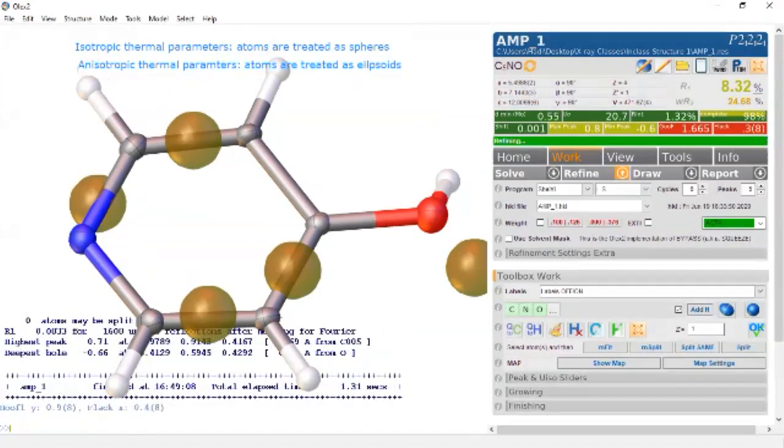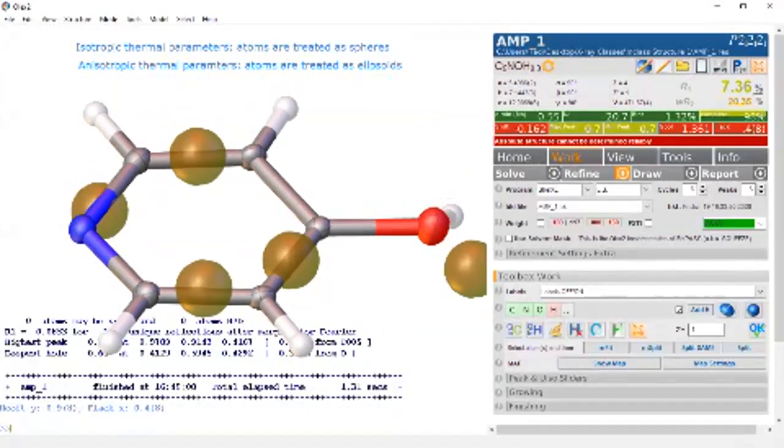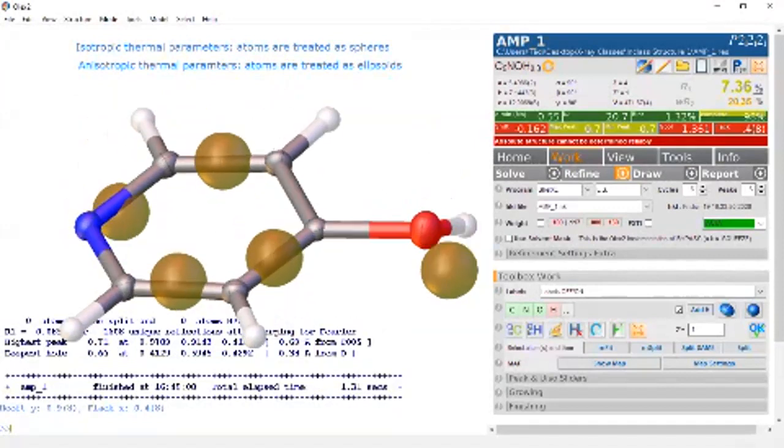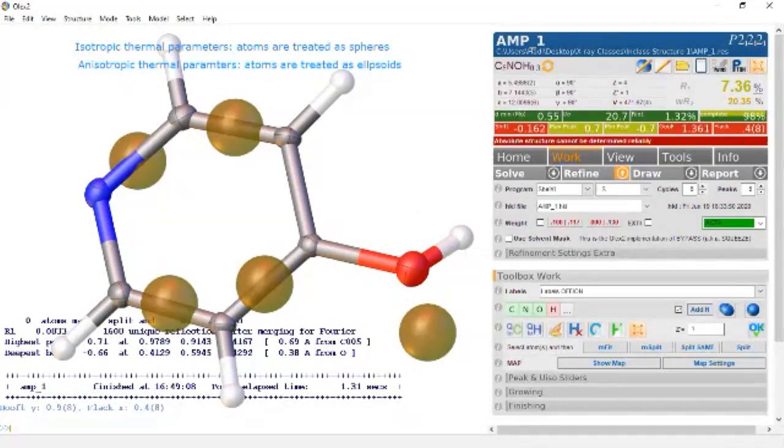So you'll see now that these carbons are sp2 hybridized, so they only need one hydrogen. So you have to kind of confirm that there's the correct number of hydrogens. So again, each carbon is sp2 hybridized, so they should have one hydrogen. That's good. Now over here on the oxygen, you see it placed one hydrogen because remember oxygen, OH. But you'll notice that right here, we have an additional electron density peak that is close to the oxygen. So this must be something important here because it's very close to the oxygen atom.